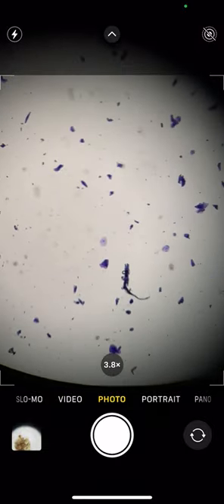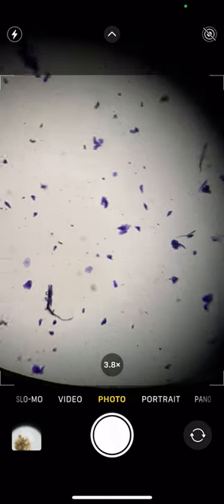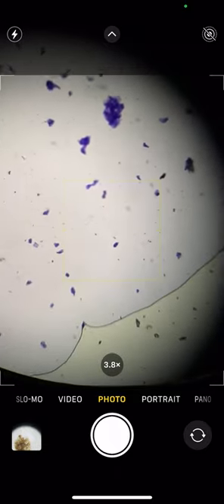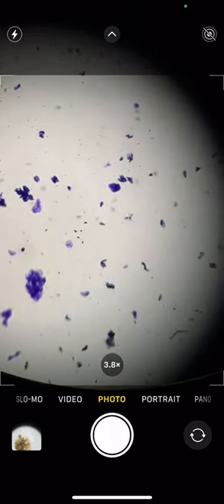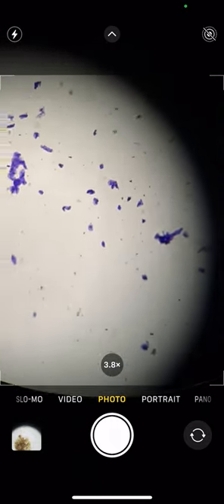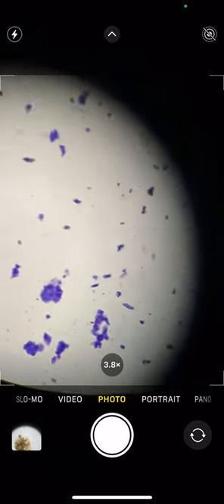We're going to try and find, ooh, there looks like a good cell. See lots and lots of cells because I'm a good cheek scraper. I'm good at getting cells off my cheek, my mouth cheeks. I know someone out there has a dirty mind.